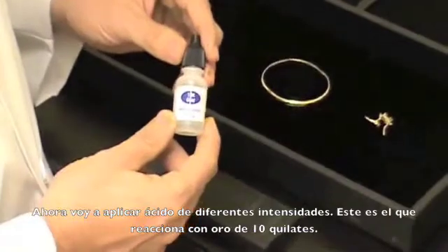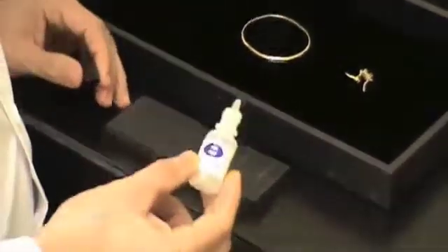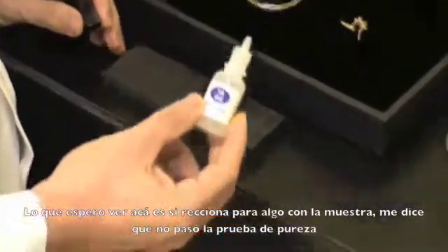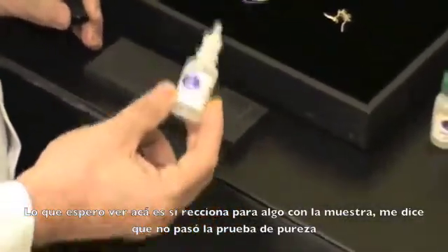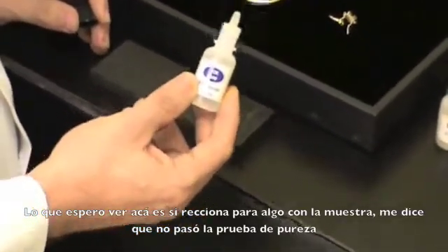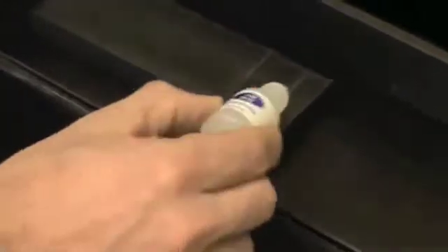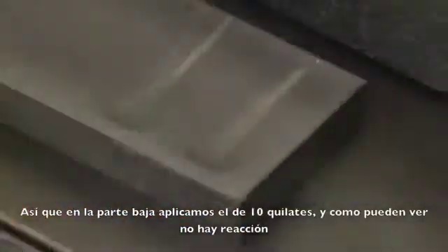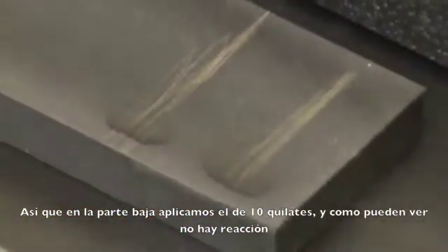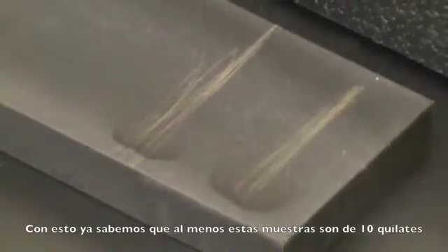This is 10 carat acid. What I'm looking to see is if this reacts at all with the filing — it tells me that it did not pass this purity test. So at the bottom we're applying 10 carat and as you can see there's no reaction, so we at least know that these filings are 10 carat.